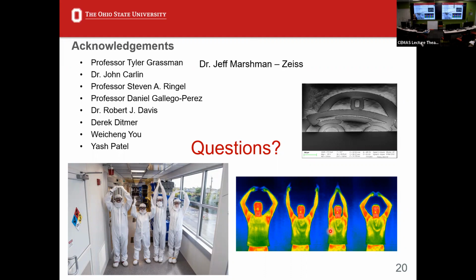Yeah, one question. You say that when you look at the cross sections, you only cleave the sample. So the question was, when we look at cross sections, we only cleave. Yes, part of that is because we don't have a FIB SEM. But part of that is, in the case of a lot of what we're doing, it actually works really well. Obviously you do stress the materials as you're cleaving them, and sometimes you can see that. It's a really good question, actually. We design our patterns when we're doing process development and tool development so that we can do that.